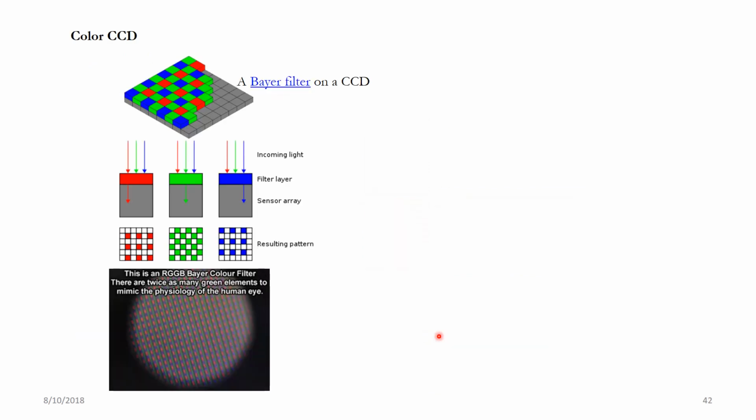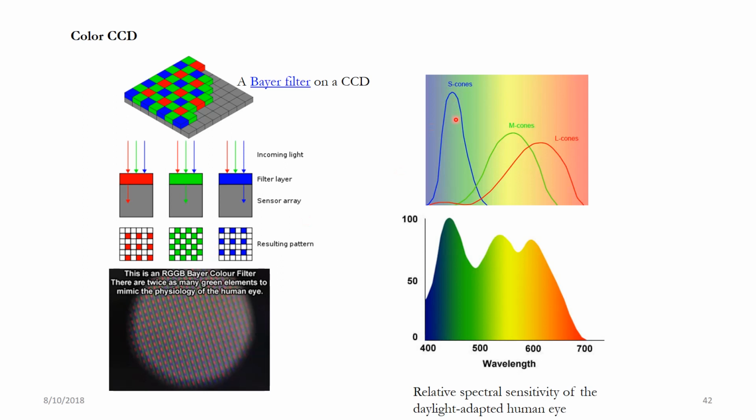If you might have also seen, there are detectors which are like color cameras, like the cell phone camera is a color camera. How does it work? The answer is simple. In front of the detection unit there is a filter like this, which can filter out colors in RGB format, red, green, blue. You must be curious, why are there twice the number of green compared to red and blue? It's because your eyes are more sensitive to green compared to blue and red, and that's why in order to compensate for that loss you have to have twice the green.